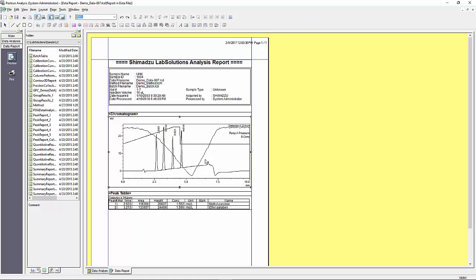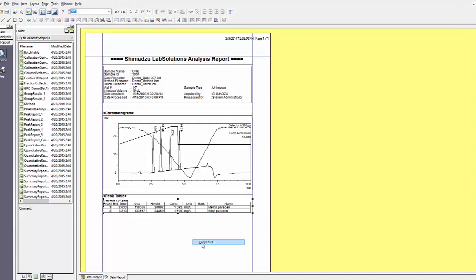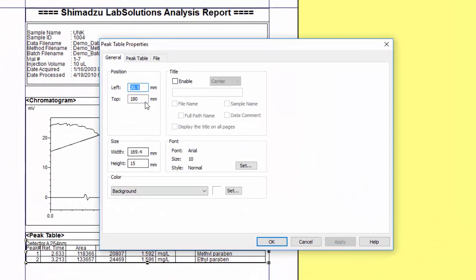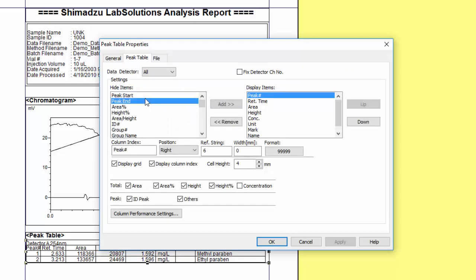To report on the actual quantified results you will need to have a peak table. To see options available for you to customize the peak table, right-click on it and select properties. Under the peak table tab you will have a list of items on the left that are available but hidden, and a list of items on the right that are currently being displayed.